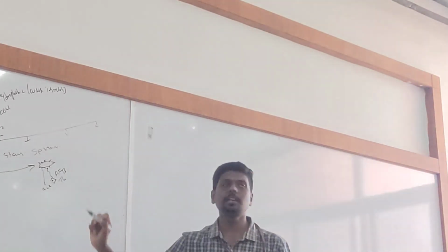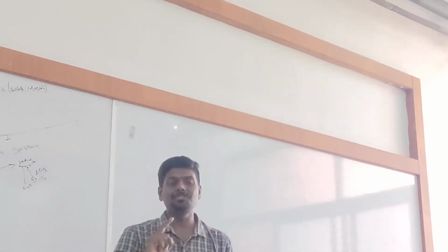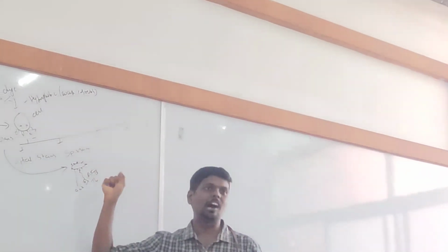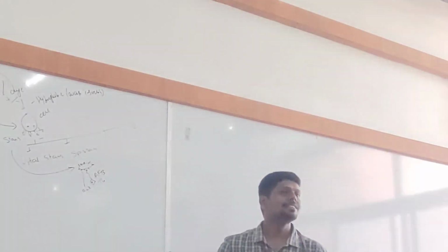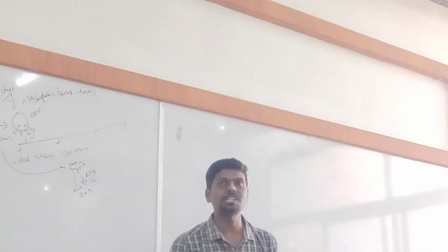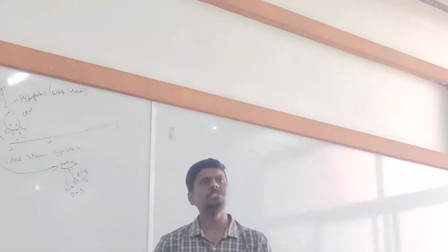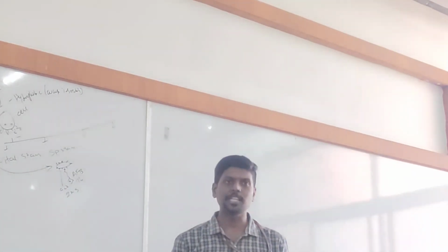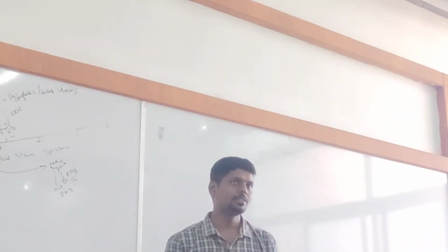Tuberculosis. Mycobacterium tuberculosis. So, to stain tuberculosis, we need a special stain that can penetrate a very large cell wall. And that stain is called Ziehl-Neelsen stain, or ZN stain. So ZN stain is one of the special stains. Now we understood what special stains are. Am I correct? Any more doubts so far?